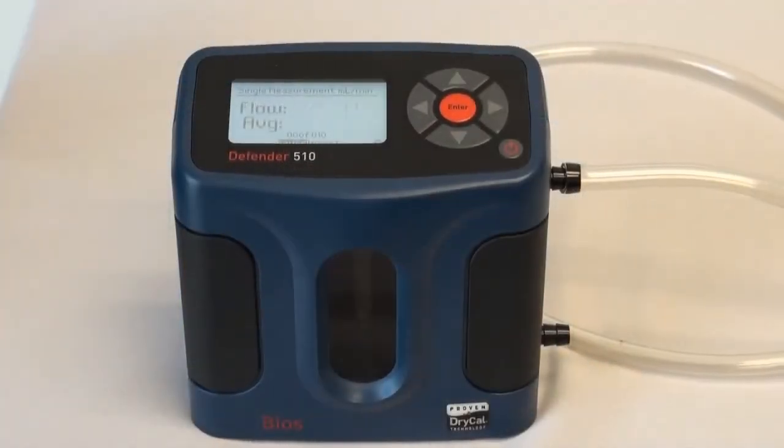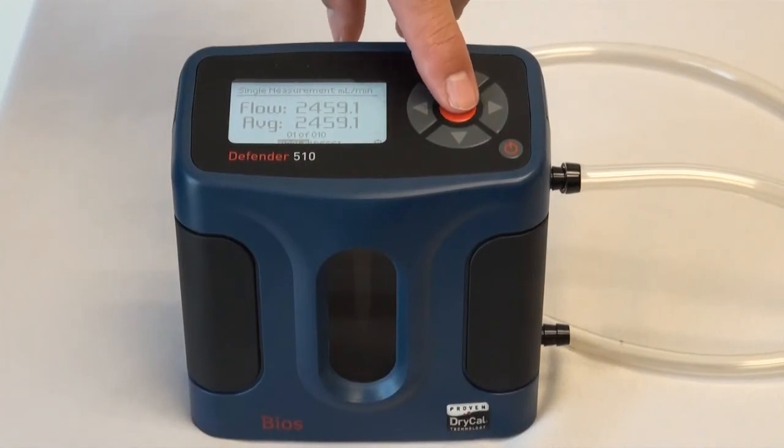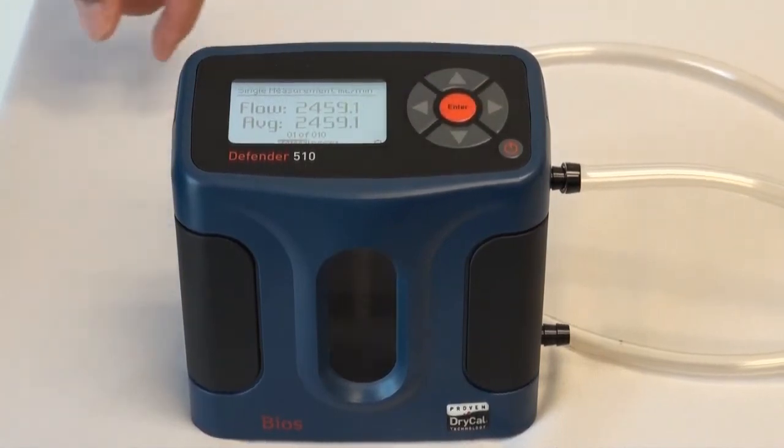As with the DigiCal, take an average of six to seven readings and adjust the Escort Elf flow rate according to your average reading.